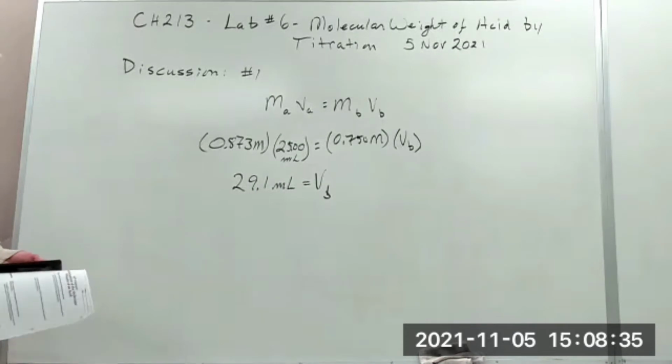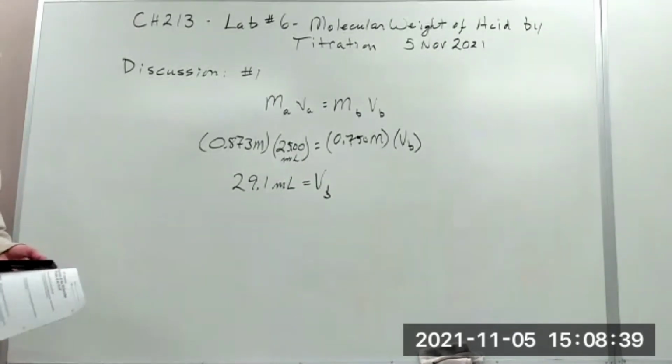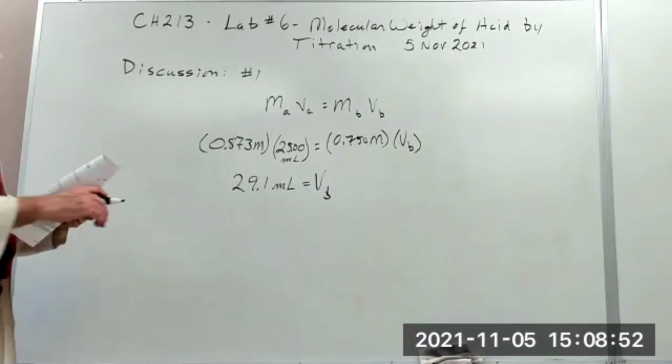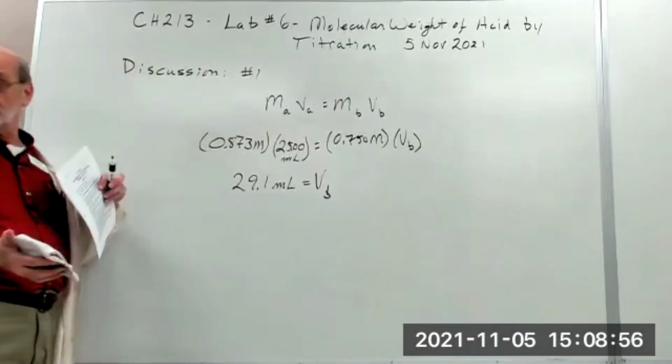And that is our equivalence point, the stoichiometric equivalence point. Okay, this is a good one. Got it? Okay.